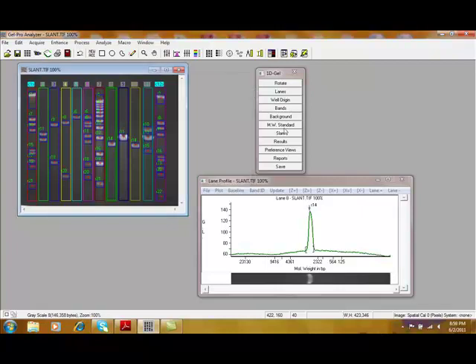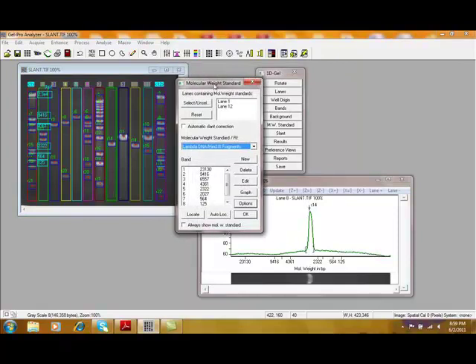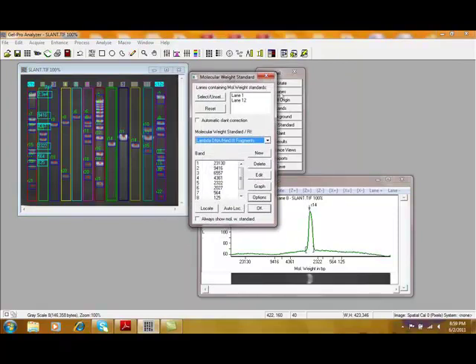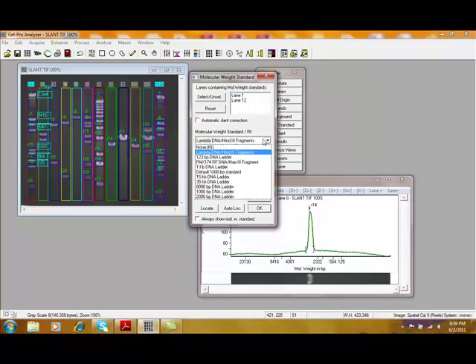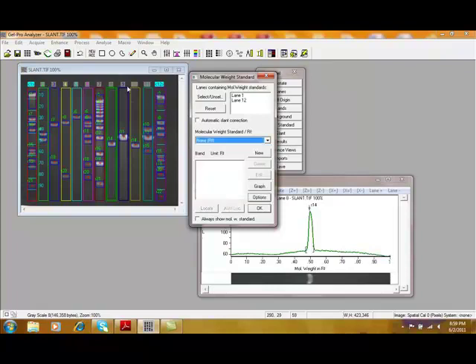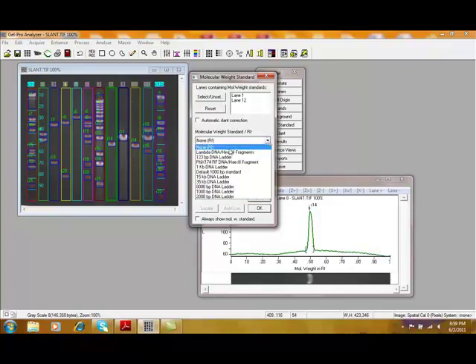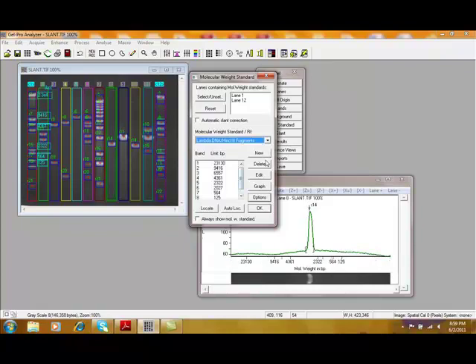Next, in this particular example, we do have some molecular weight standards that have been loaded. In this case, you can define what lanes the molecular weight standards have been loaded. In this case, there are lanes 1 and 12. And from here, we have a number of DNA molecular weight standards. Let me just set that to none. You can simply choose the appropriate molecular weight standard. In our case, it's LambdaDNA cut with HIN-D3. And I'll simply press OK.